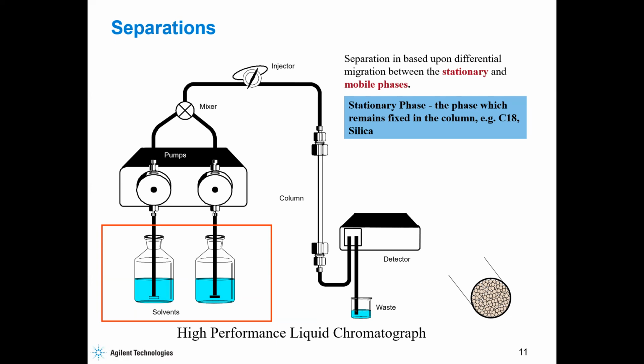And if I want to run the IR of component 2, once the detector shows on the screen that component 2 has been eluted, I'll quickly come here at the bottom, put a vial and collect that fraction as it's flowing out. Maybe I want to do NMR or IR analysis, so I can recover. But in a destructive detector, once it gets into this place and is destroyed, I can't retrieve my sample again. That's what we mean by being destructive and non-destructive.